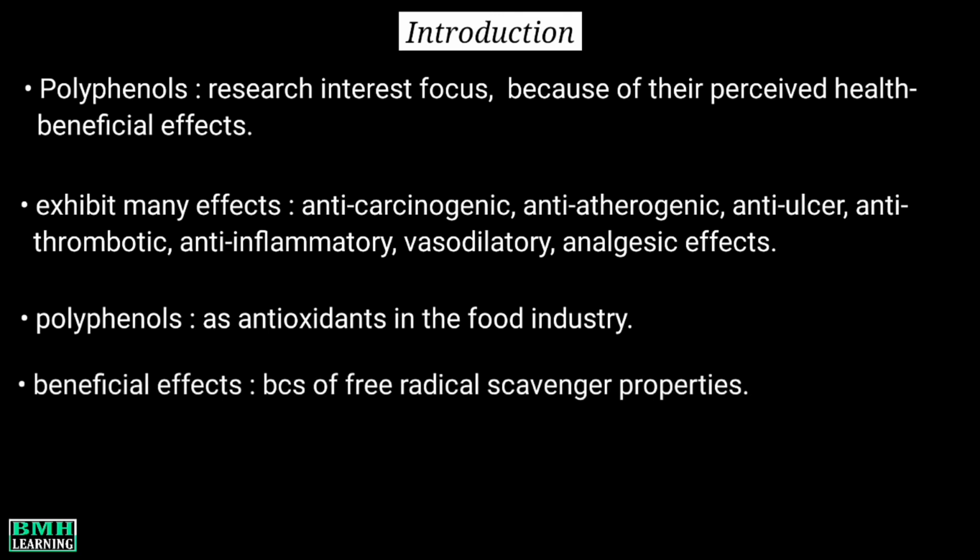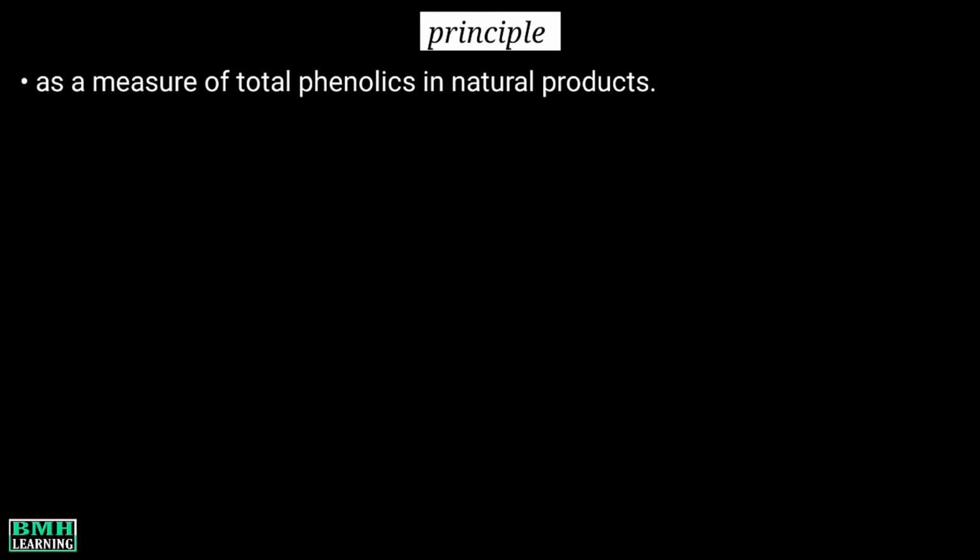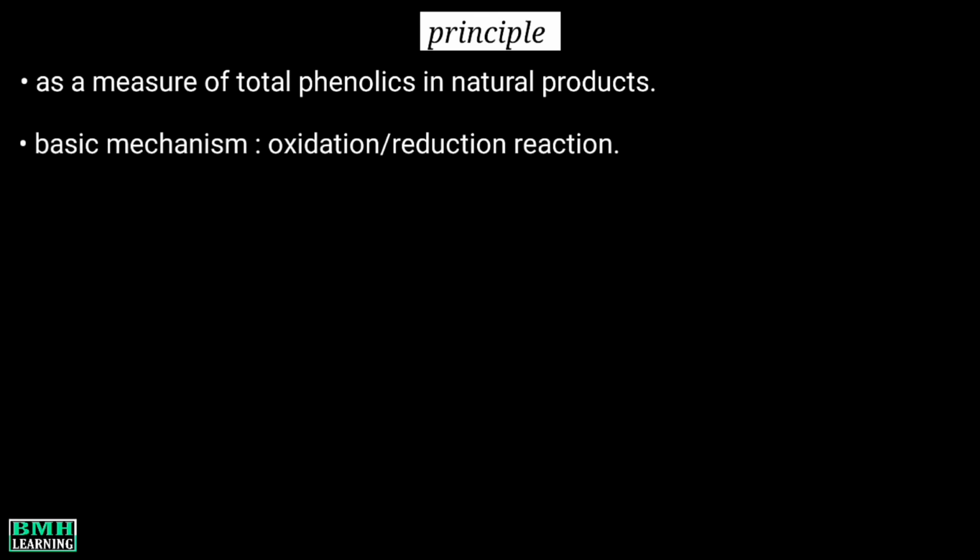The beneficial effects are due to their free radical scavenger properties that block the deleterious action of free radical molecules on cells. Assay principle. The FC assay has been used as a measure of total phenolics in natural products. The basic mechanism is an oxidation-reduction reaction.